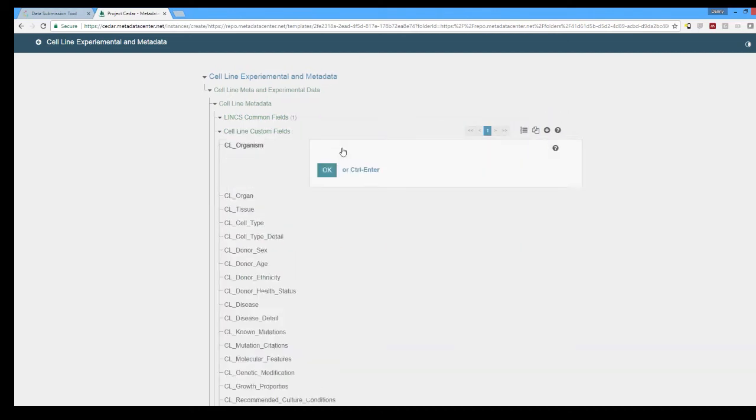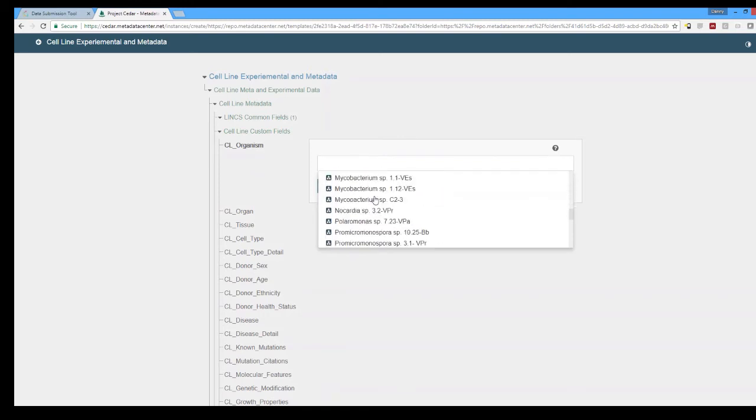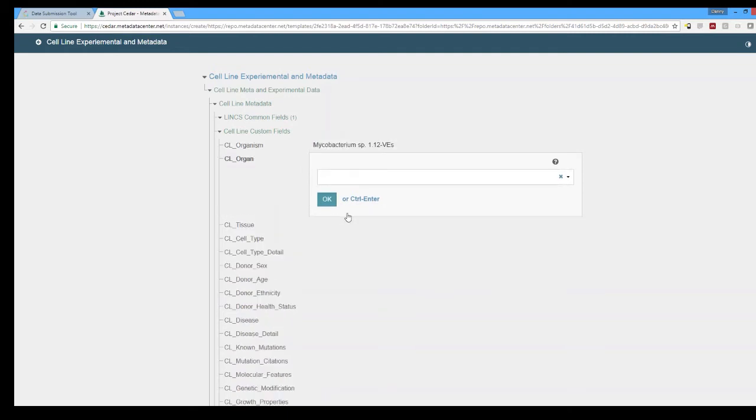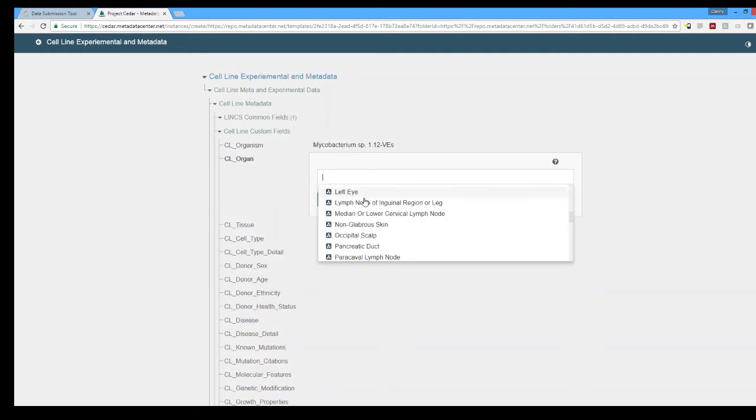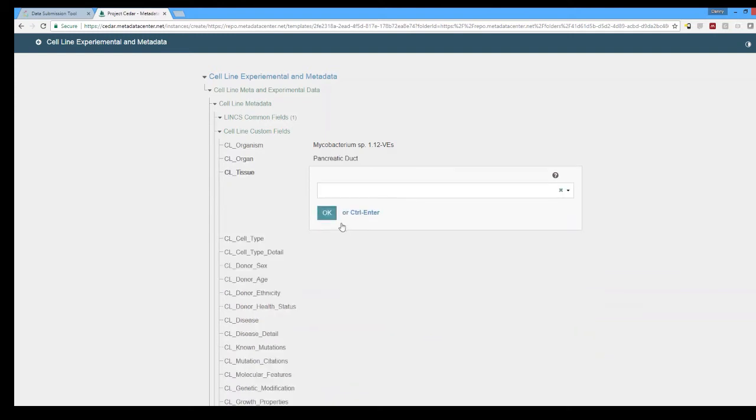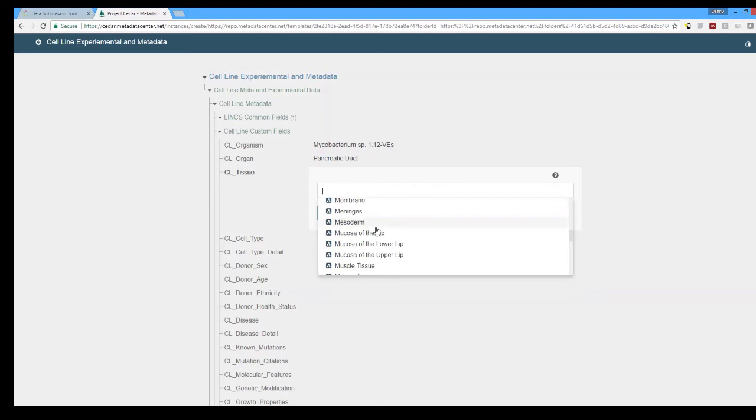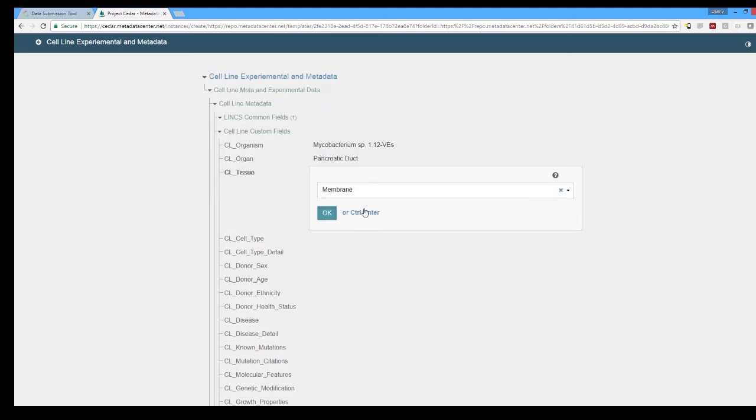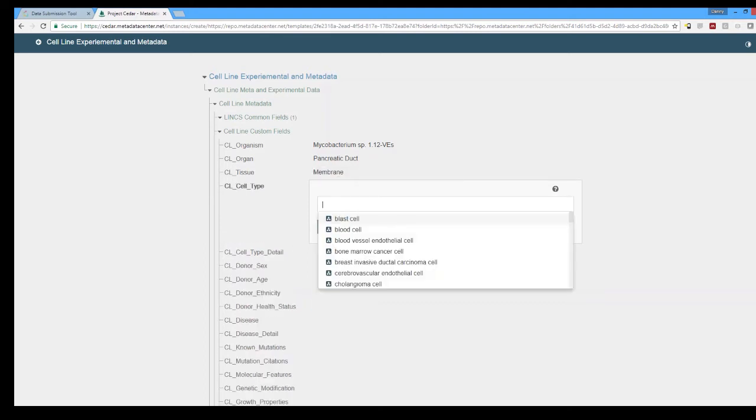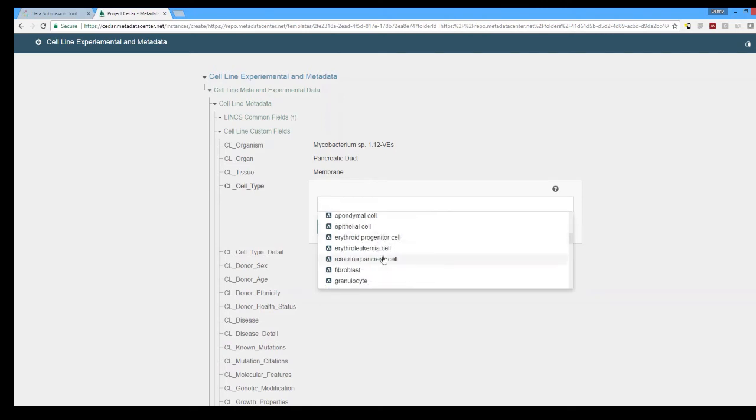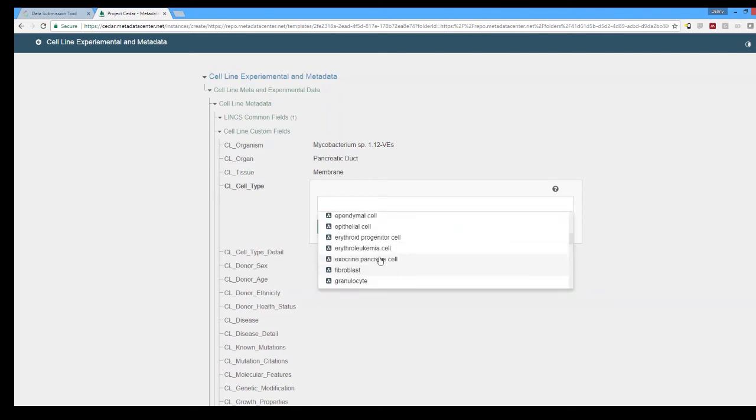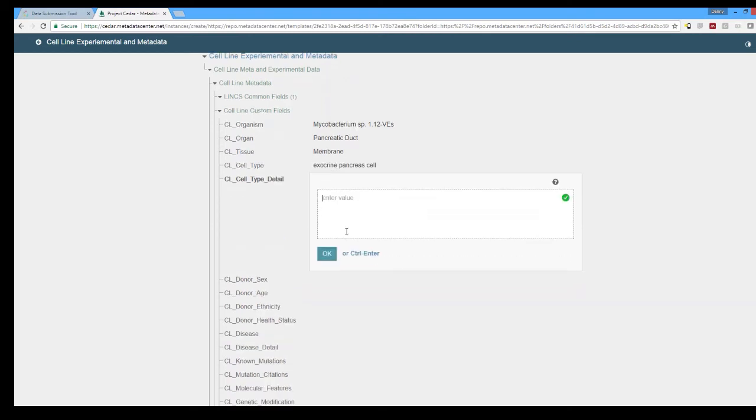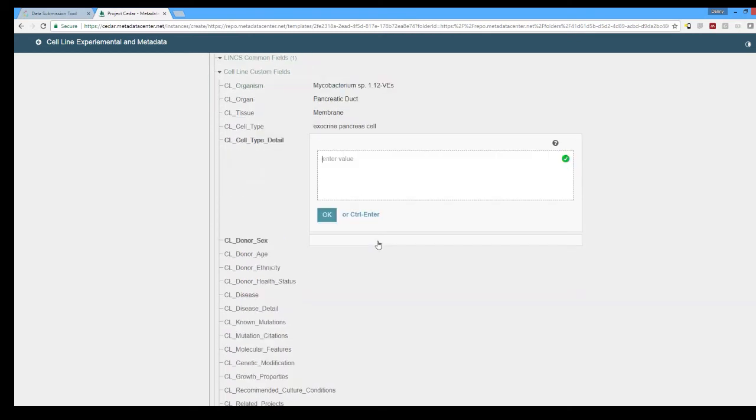Going to the organism we do have this connected to bioportal and we can select from a dropdown list which one we want. Same thing for the organ that the cell line came from and in this case we'll be selecting pancreatic duct even though mycobacterium do not have pancrei we'll still do it just for the sake of this little demonstration. Same thing for the cell type these are all connected to specific ontologies within bioportal that are set up during the generation of these templates and the individual elements that make them up.